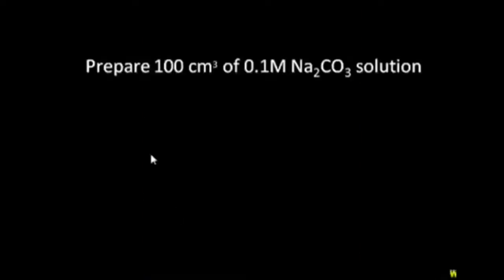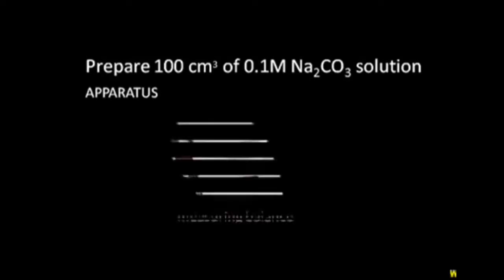Assalamu alaikum class. Experiment number 12 of your practical notebook is to prepare 100 centimeter cube of 0.1 molar sodium carbonate solution. The solution we have to prepare in today's practical class is 0.1 molar sodium carbonate solution in a volume of 100 centimeter cube.